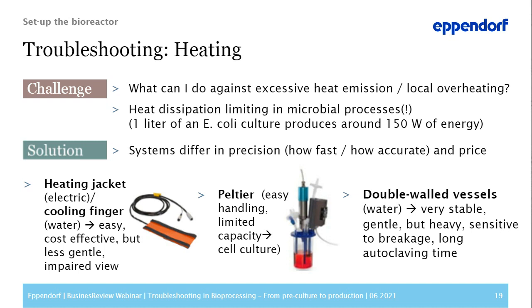While small reactors require only external cooling jackets or external cooling coils, which have the advantage mainly of being free of cleaning problems. So internal heat transfer methods are usually a little difficult to clean and they can be easily fouled by the cell growth on the surface.